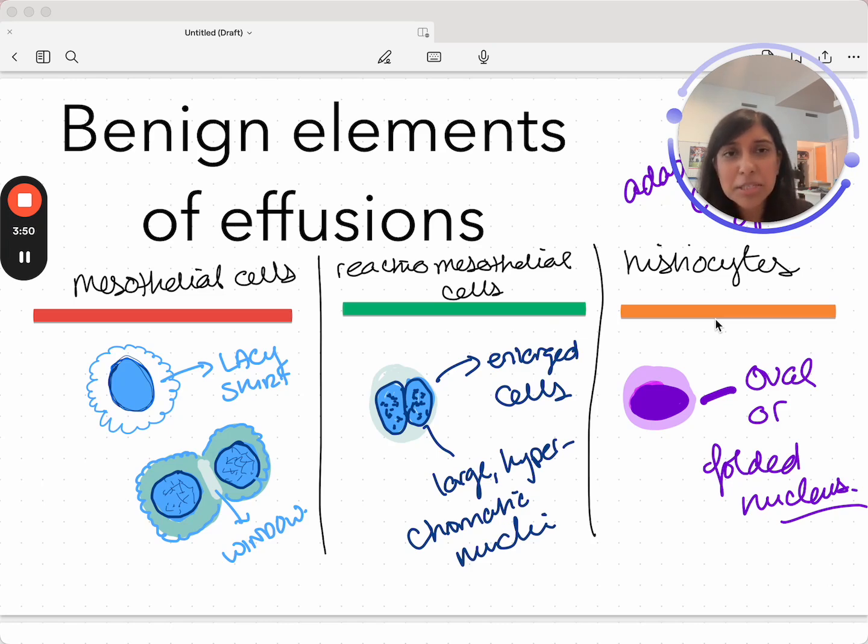That tells you what's going on with the patient. So I hope that this helps. A really short video, but just trying to help you slowly introduce yourself to effusions and what sort of cells you'll commonly look for.